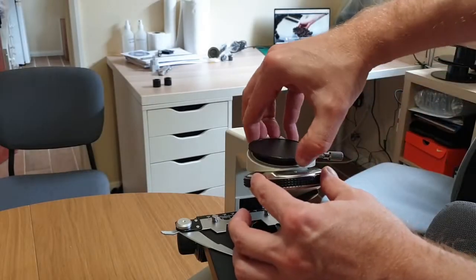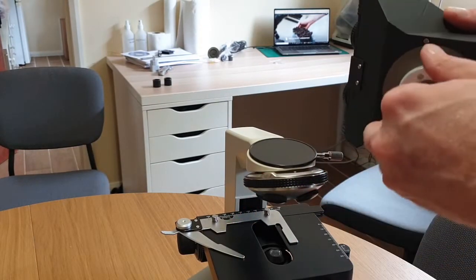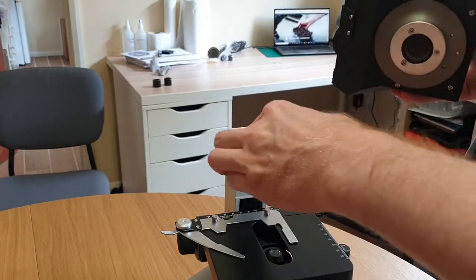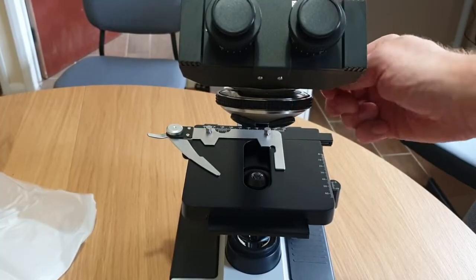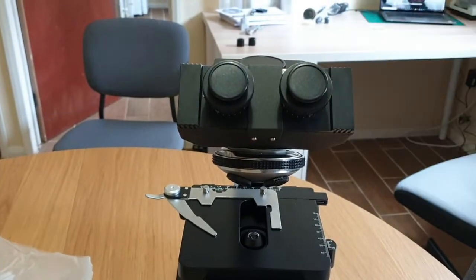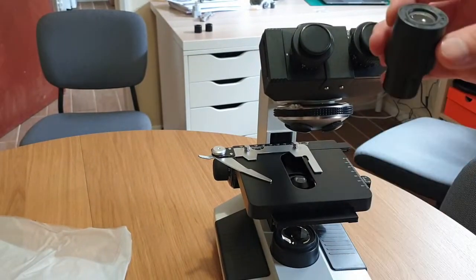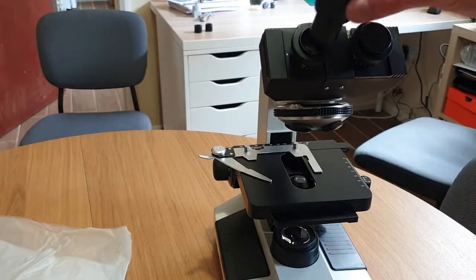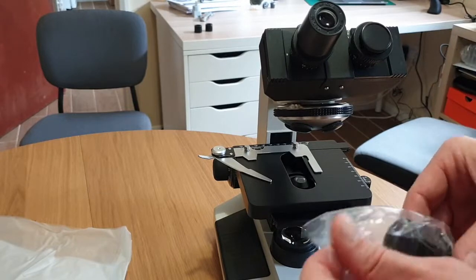We start the assembly by loosening a screw on the right of the nose piece — it locks the head in place. In use you can gently loosen it to swivel the head over to show someone else what you're looking at. Next come the oculars. We use the 10x as opposed to the 25x also included in the kit. They simply slot in after taking the dust caps off. Limiting the time with the internal optics exposed to dust is critical.